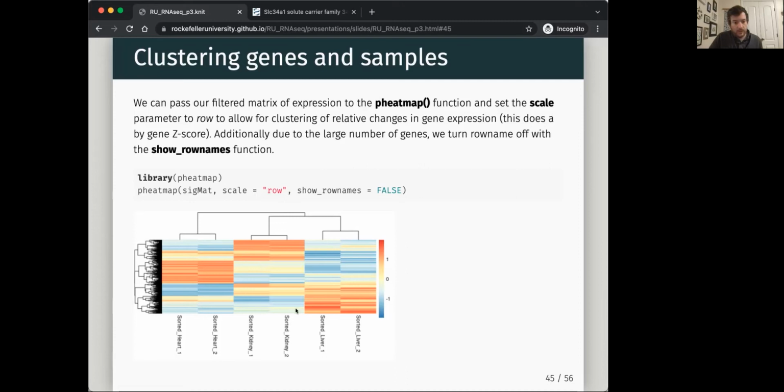Okay, so this is nice. And you can also see it's drawn some trees. So yeah, Charles asked a question. So the heat map is not absolute value normalized per row? It isn't. It is normalized per row, but it's a z-score. So that is kind of how many standard deviations from the mean are you, essentially.